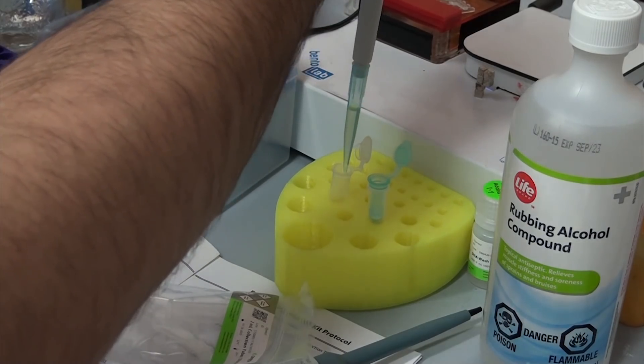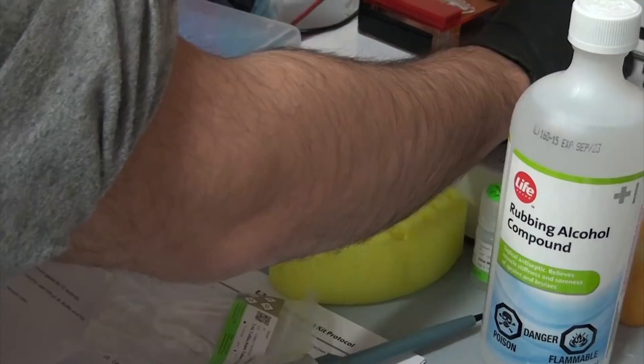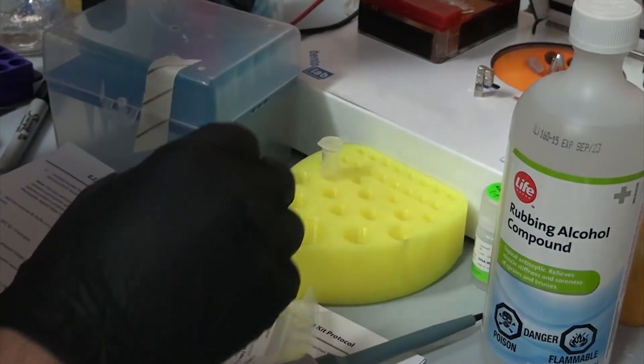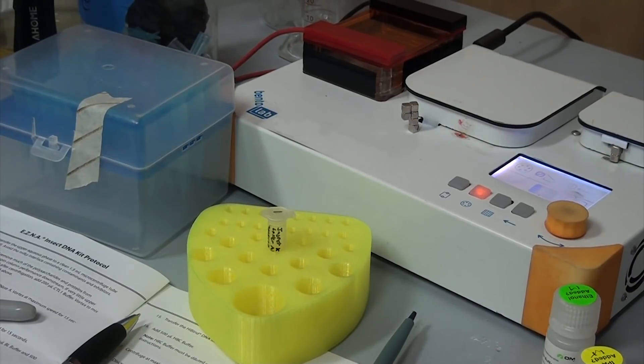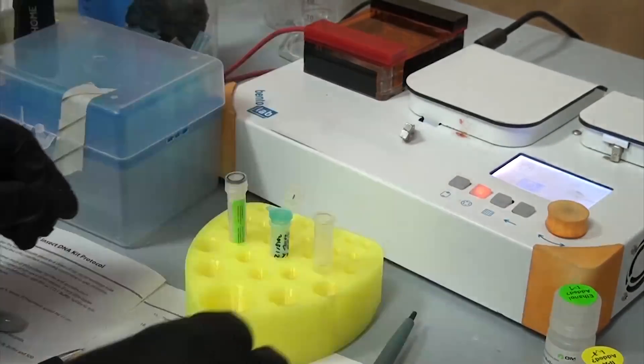However in this case, the kit says their filters are resin based, not silica based, which I thought was interesting. After spinning that down, it's onto a series of washes with the provided wash buffer. And finally, after all that, we can dry the column by spinning it empty for a few minutes, transfer it to a final collection tube, and elute our DNA. Again, letting it rehydrate for a few minutes beforehand.